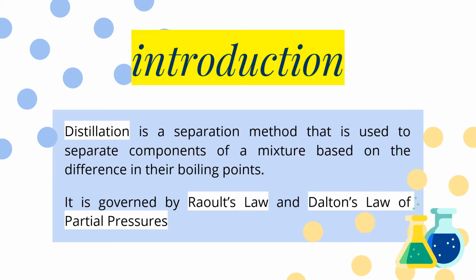First of all, what is distillation? Distillation is a separation method that is used to separate components of a mixture based on the difference in their boiling points. Primarily, you use this if you want to separate non-volatile components from volatile components or simply components with different boiling points. It is governed primarily by two principles, namely Raoult's law and Dalton's law of partial pressures.